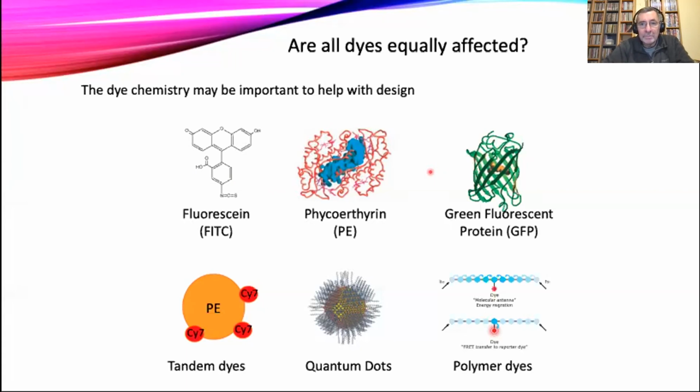Now, if I treat those big proteins with a fixative, fixatives are going to change the chemical makeup of proteins, alcohol in particular. If I fix GFP cells, for example, in alcohol, very often I lose the fluorescence. GFP fluoresces because there's half a dozen amino acids in the middle of this structure here that are in very close proximity. Remember, alcohol changes the structure of the protein.